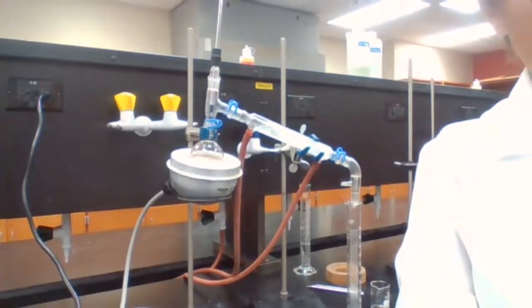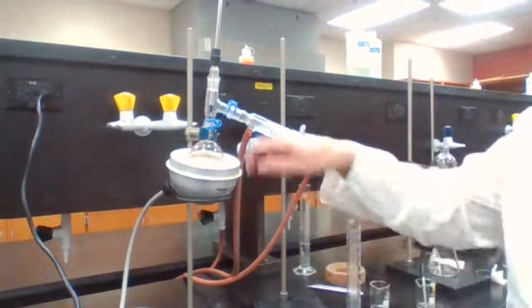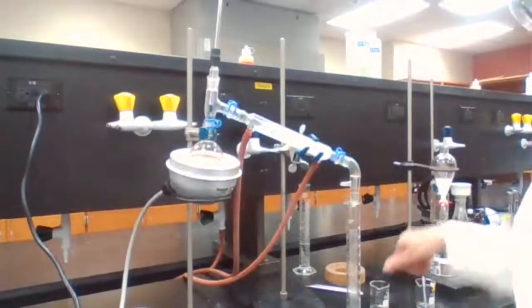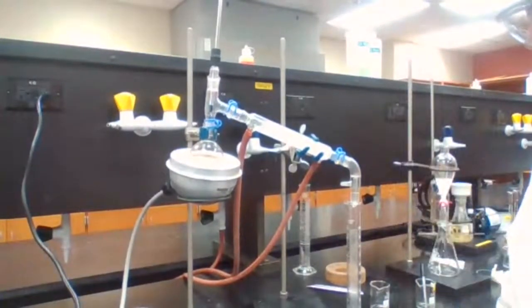When we add the sodium hydroxide, the tartaric acid actually dissolves in water. So tartaric acid will stay in the aqueous solution, or if it comes up, it's going to be in the aqueous solution. And the oily part would be the amine.